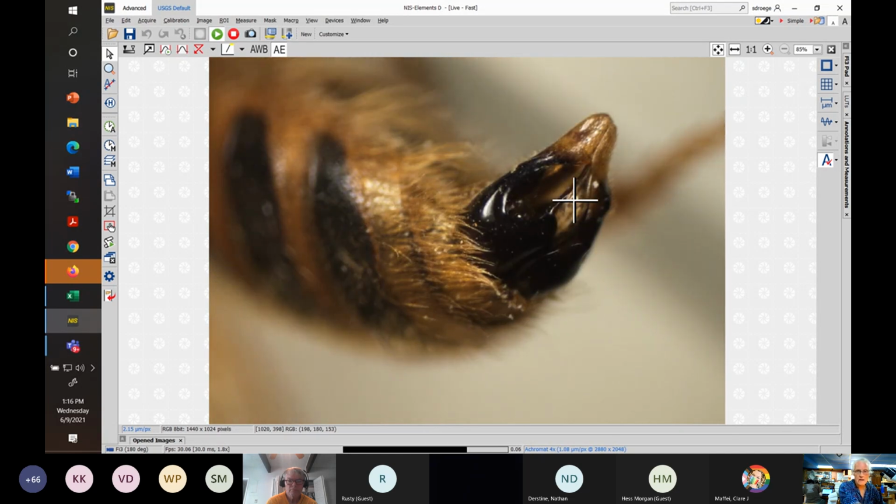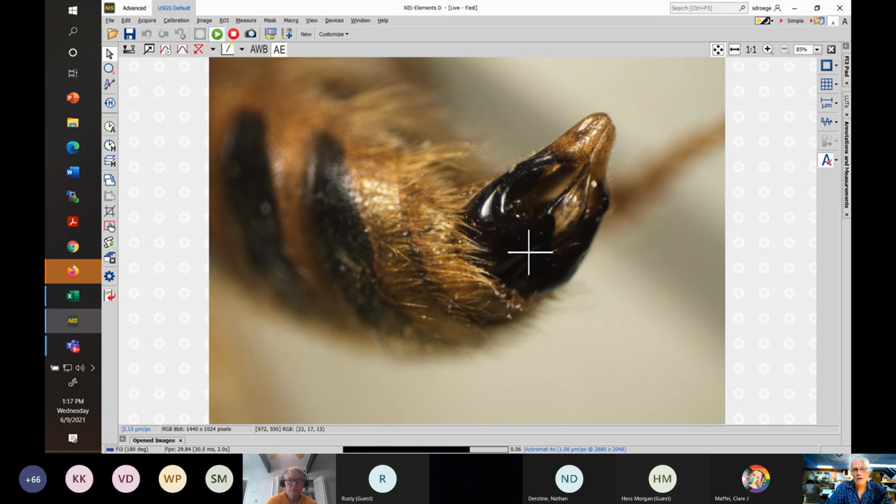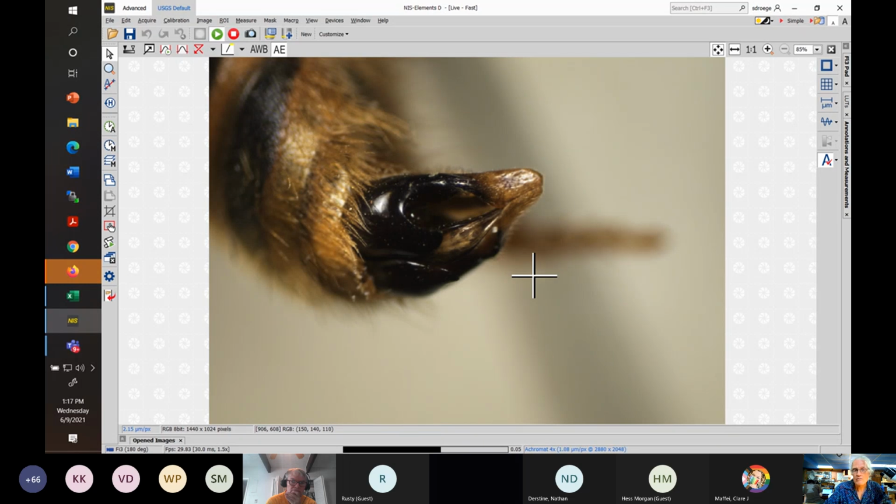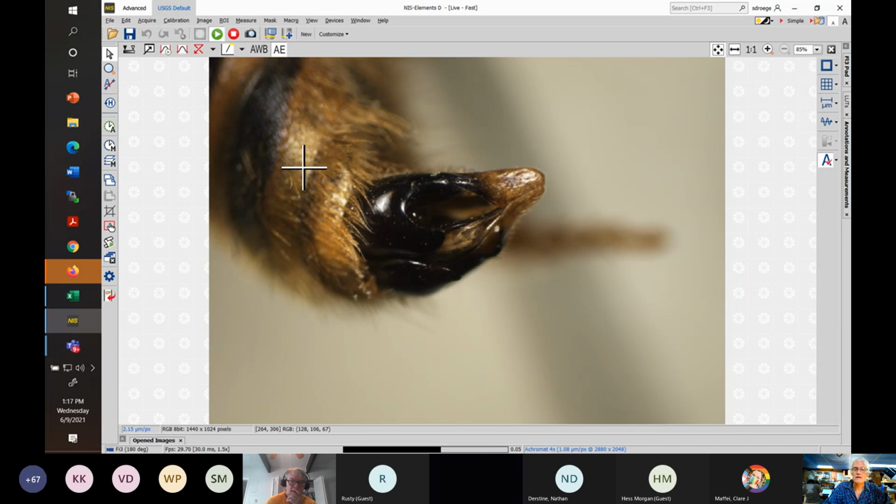In this particular case, the genitalia in this male are sticking out. I would have to refresh myself in terms of the terminology for the genitalia here, but the genitalia are very distinctive, often at the species level. In Andrena in particular, they're used quite a bit. We tend not to use them because many times you don't have the extruded genitalia. It's retracted back in, and you either have to pull the genitalia when the specimen is fresh, or you have to go through a pretty laborious process, which may or may not result in damage to the specimen, to evert it after it's been dried.